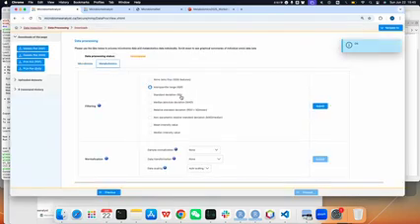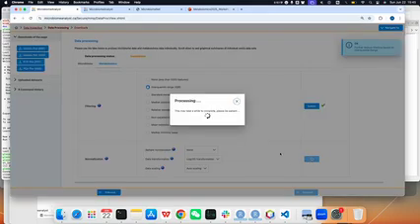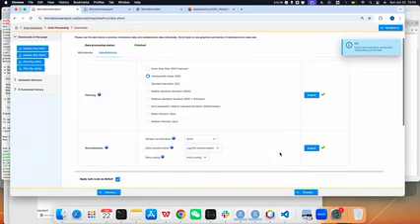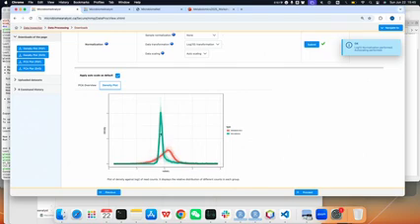For the metabolomics data, as we should have mentioned in the statistical module, we also need to do filtering and normalization. We just keep the log transformation, as we usually use for metabolomics data. The only thing to mention is that we usually keep the auto scale as default to make the two omics data more comparable on a similar scale.